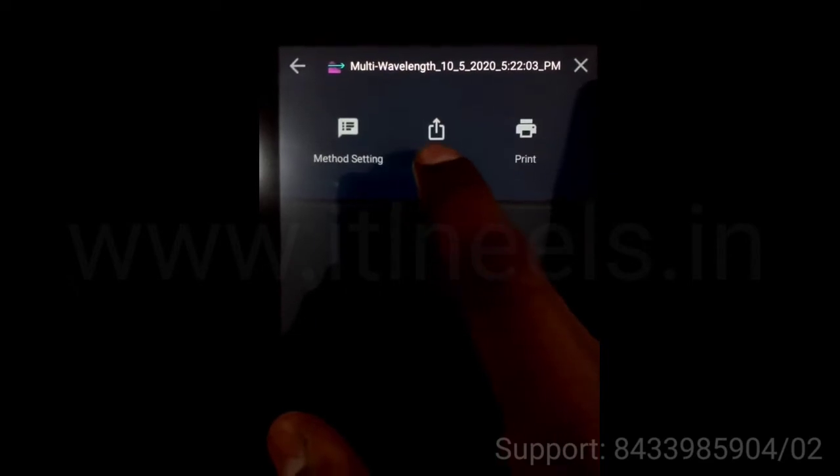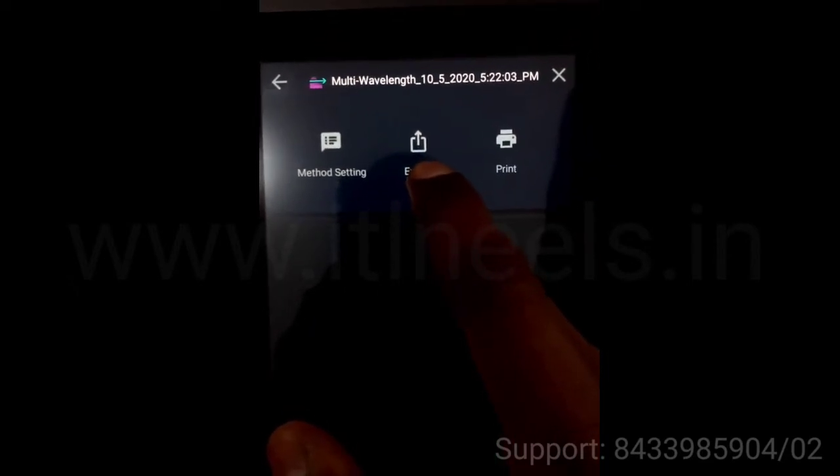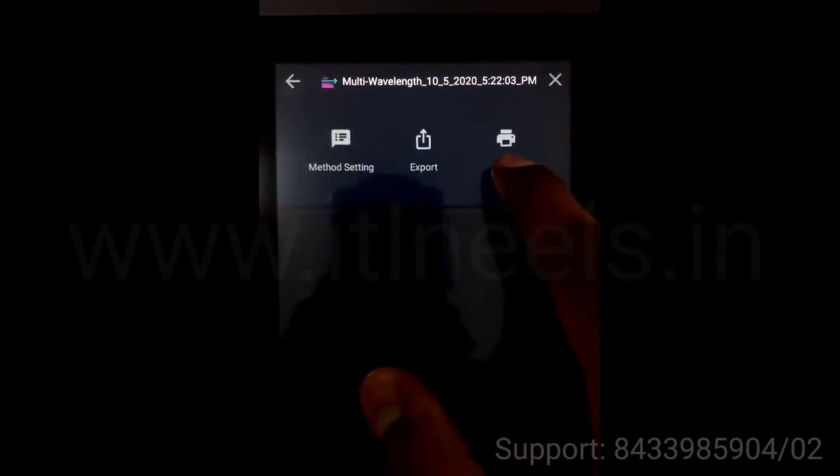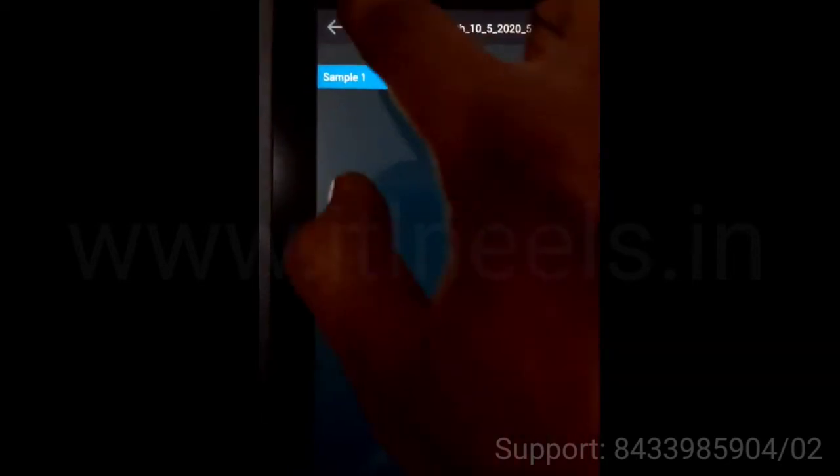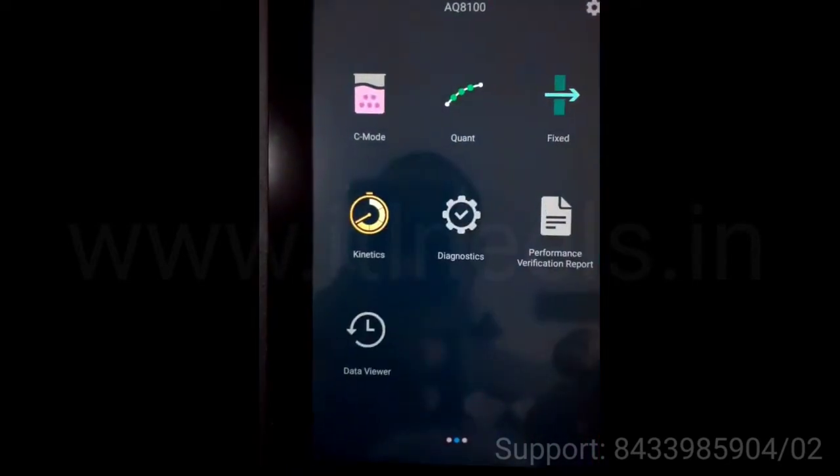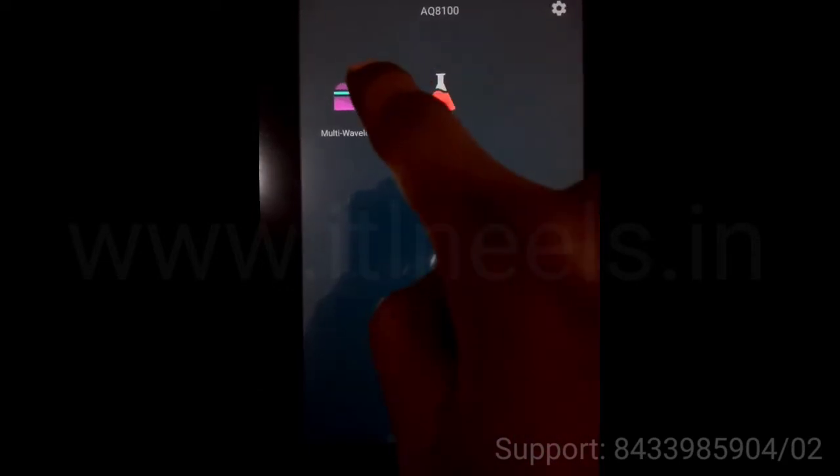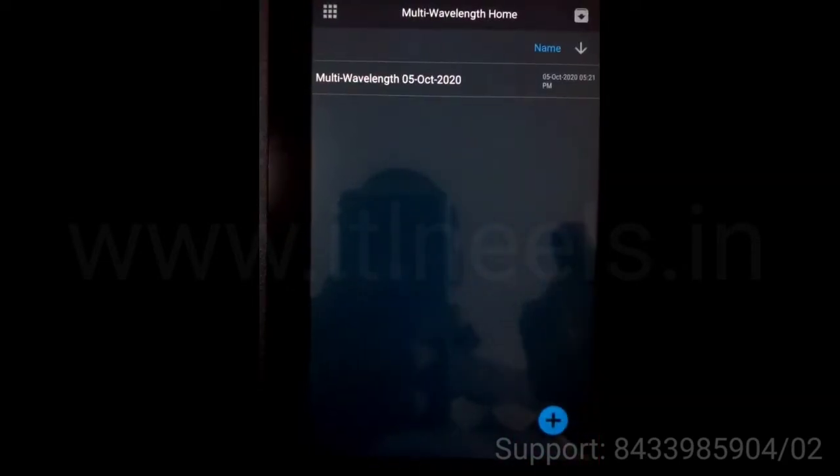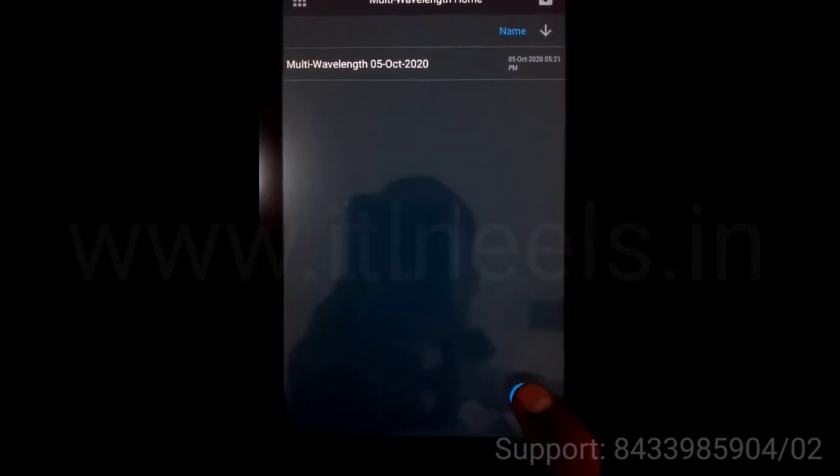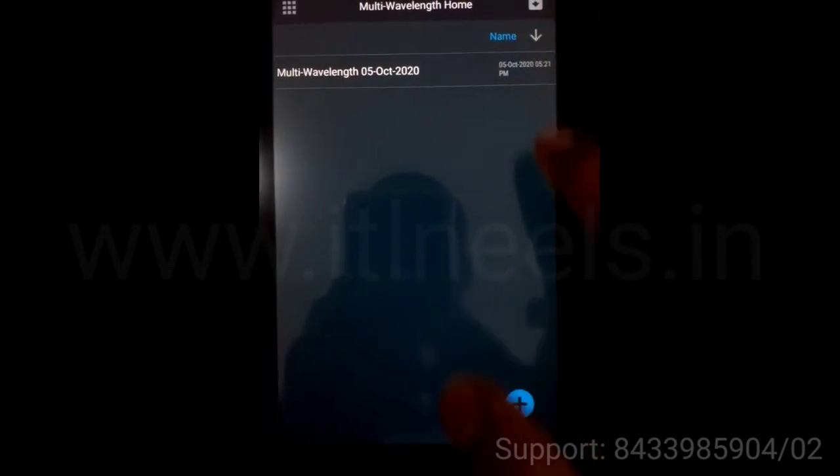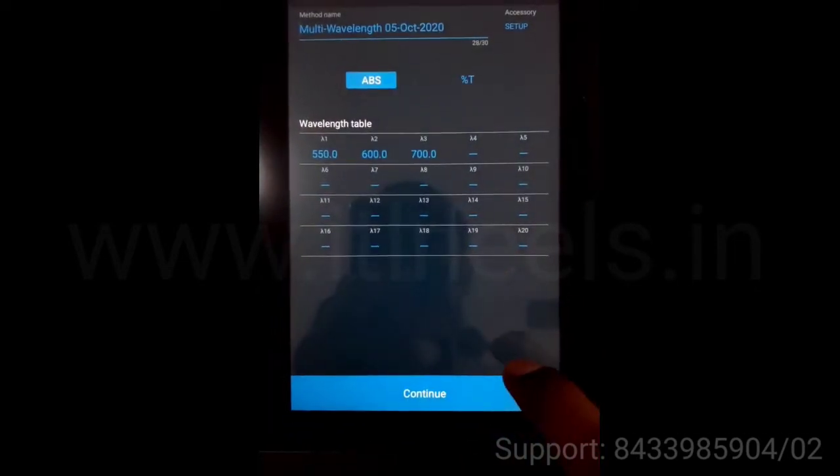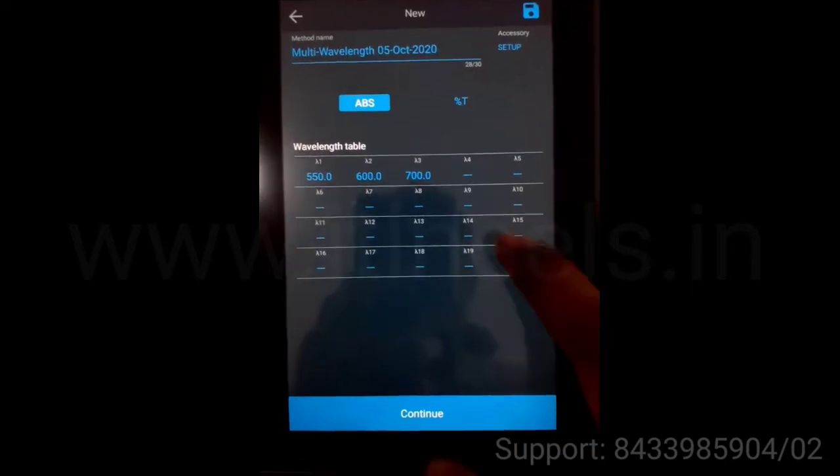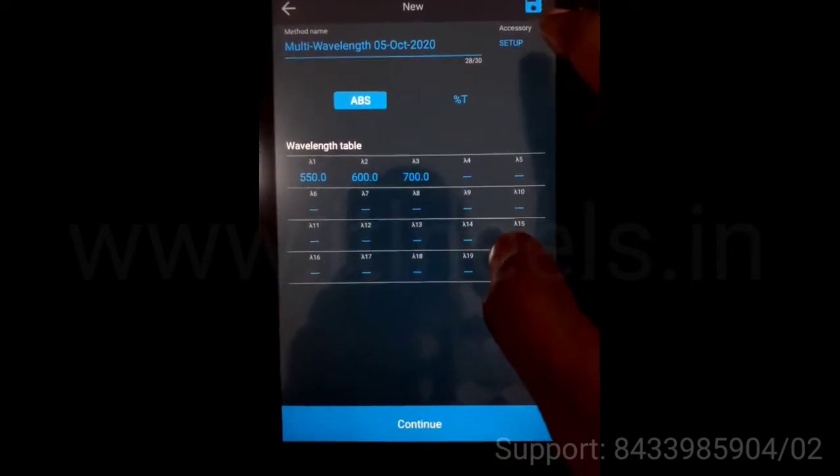You can export it to USB or WiFi. You can take a printout. This is the multi-wavelength scan method. Here also you can import it. You can make the necessary changes and save the method over here.